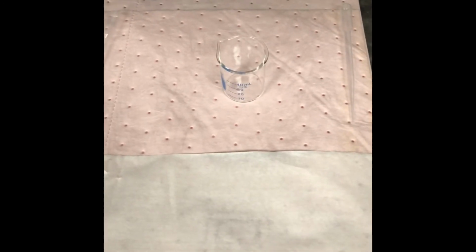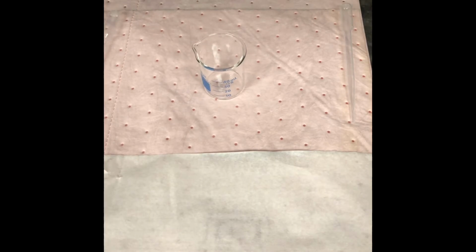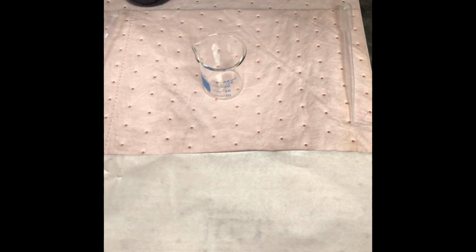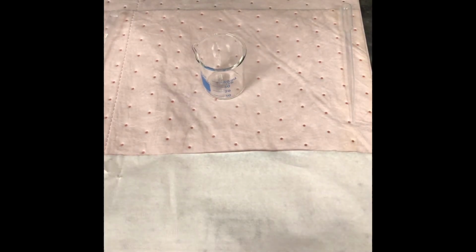All right, everybody, here we are in the lab, in the hood, to perform the reaction, the making of the nylon. I have a 50 ml beaker to perform the reaction in. I have both my reagents, the adipoyl chloride and the 1,6-hexane diamine. Now the diamine is in water, and the adipoyl chloride is in hexane. Those two don't mix. So we'll put them together, and at the interface between the two phases will be the nylon being produced.